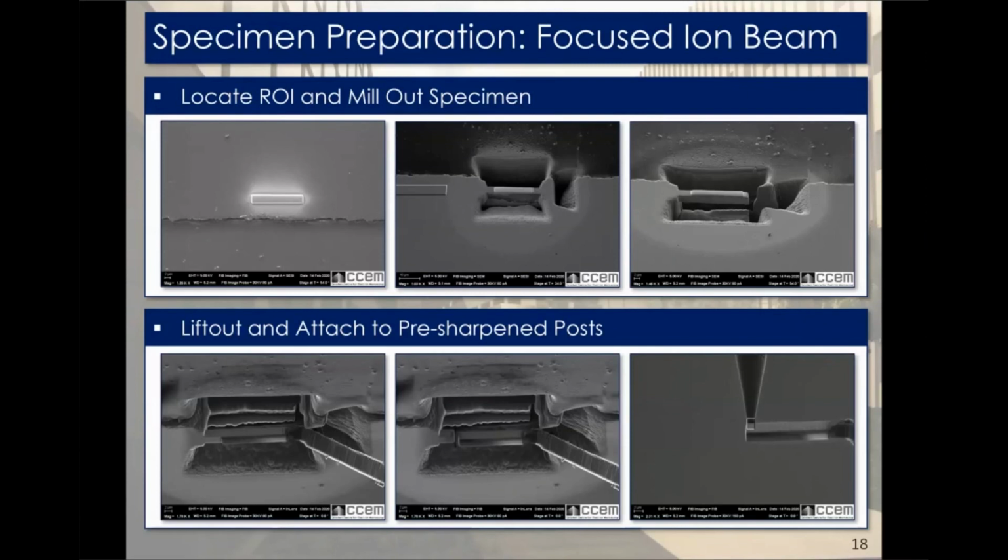So people say that this is kind of like the Toblerone stage. Our cantilever is kind of like the shape of a Toblerone, like an upside down Toblerone bar. And just like how with a Toblerone, you break it off piece by piece, that's kind of what we do with this sample too.